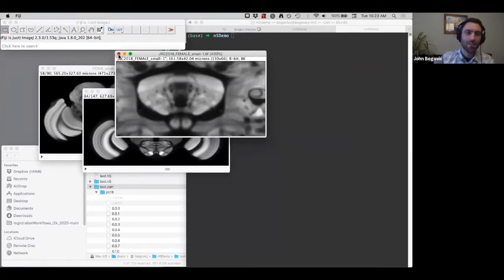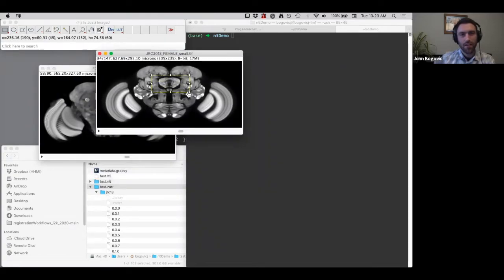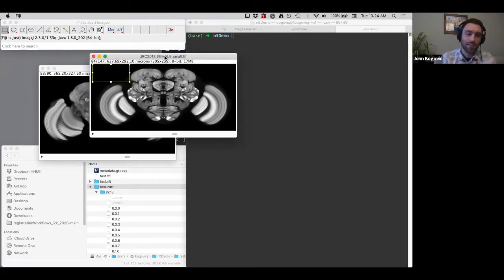What this should do is, if I open this again and I wrote this at the origin, opening the image again would have resulted in a copy of this displaced here. So if I opened it again, I would have wanted to see this image as is, but this block would have contained the image content here. This is easier to do with code, and I usually do it with code, but it is, or rather should be, a capability of the plugin. And of course, it just didn't work for me now. It did work for me yesterday, though, on a different machine.